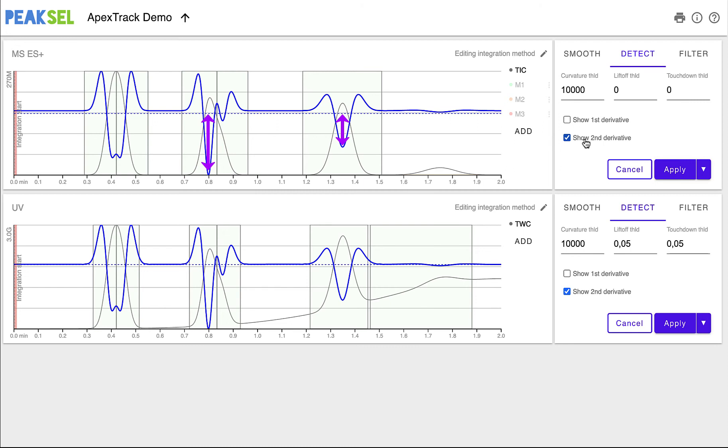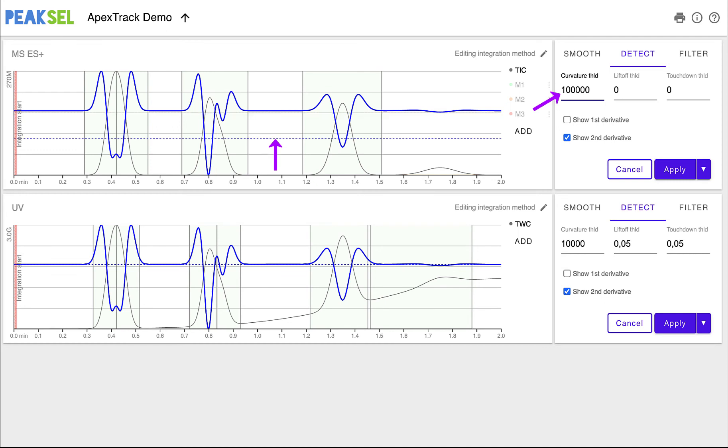The valleys of the second derivative have different depths depending on the steepness of the peak. This allows us to distinguish between actual peaks, which are usually steep, and baseline fluctuations, which are slow changes of the signal. Curvature threshold determines how deep the valley should be to be considered an apex.